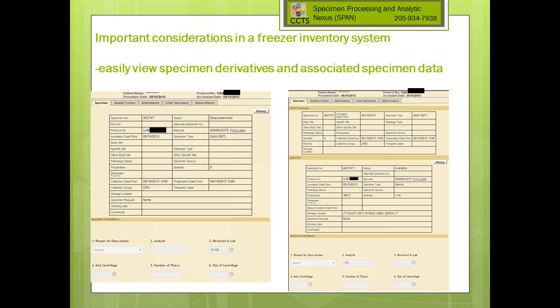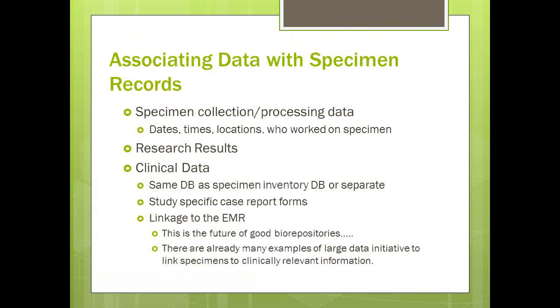I think if you're interested in looking at this more, we're happy to show you. If you're going to manage your own samples, you just need to think about these things. How much detail do you really need to have about your sample? And what's the best solution to store that information?